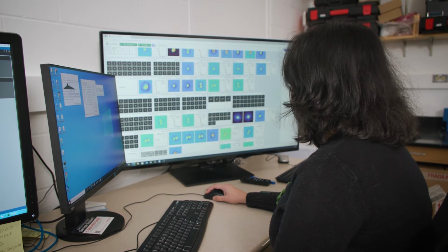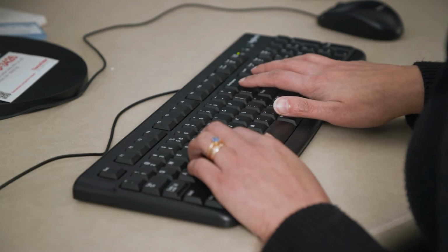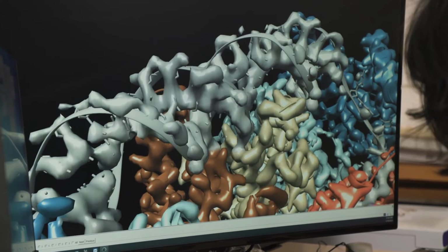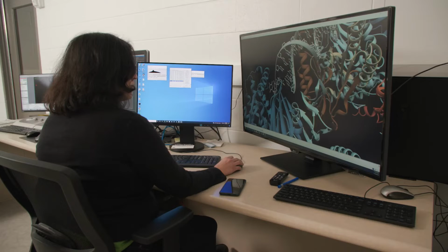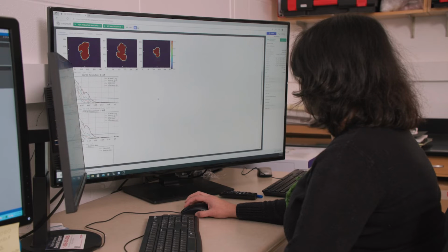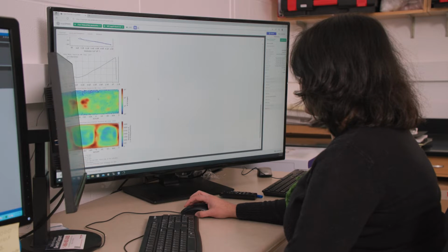I'm a structural biologist who has always been interested in nucleic acids, and especially in RNA. One of our major targets for structural studies is a complex that has been really recalcitrant to study by structural biology. It was very clear to us immediately that we wouldn't be able to approach this complex structurally using more traditional techniques like X-ray crystallography. We simply couldn't purify enough of it, and it wasn't homogeneous enough for us to be able to crystallize it. So it was absolutely necessary for us to use cryo-EM to actually solve the structure of it.